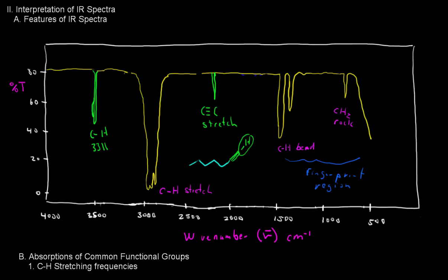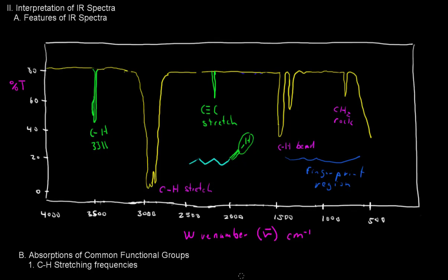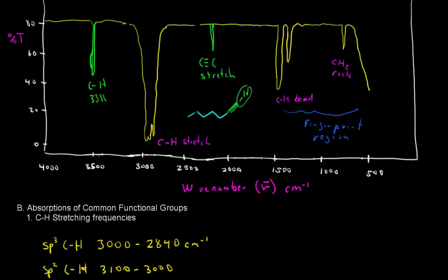And so I think that's the next one I'll briefly talk about, since I've already introduced that. As we saw just a moment ago, unsymmetrical alkynes, and we're talking about the alkyne stretching frequency, absorb in the region of about 2260 to 2100, which is right about what we saw for our hexyne above. And the strength of the absorbance is generally weak to moderate.